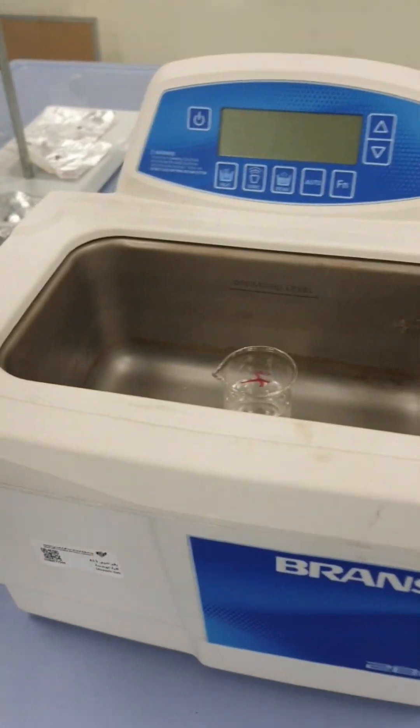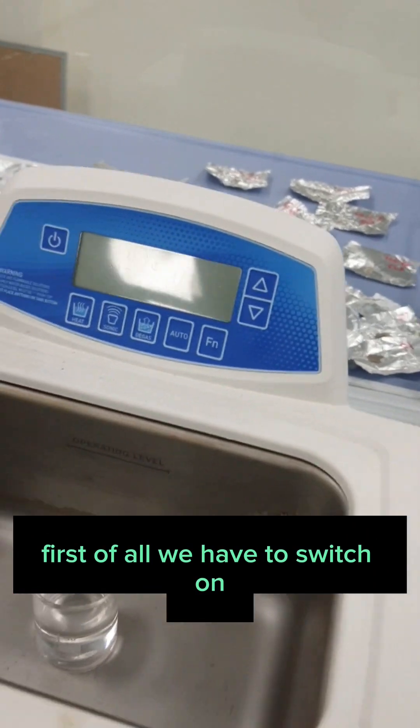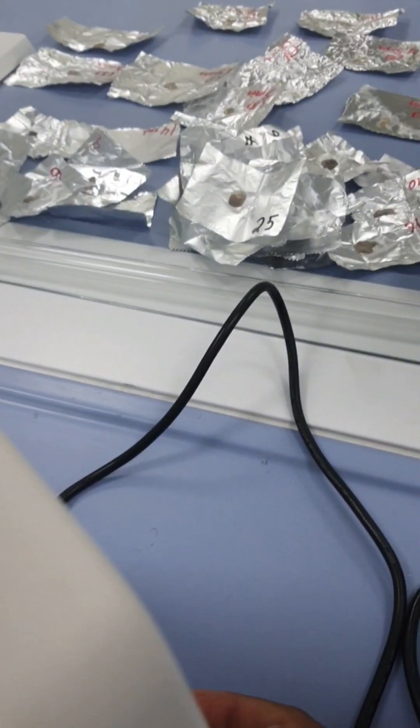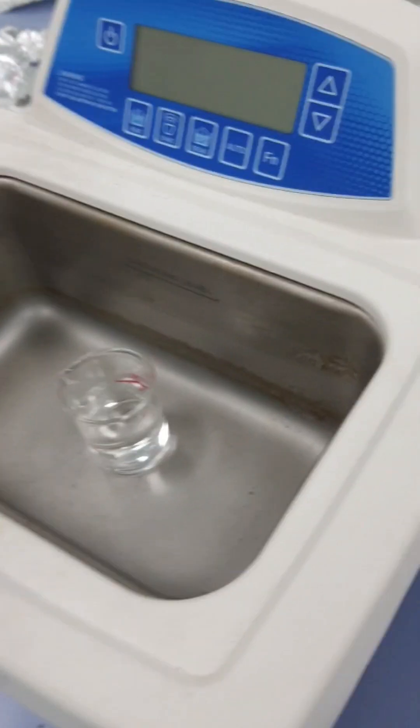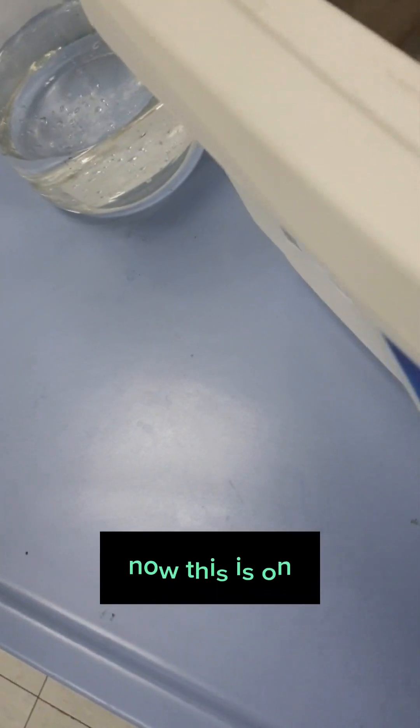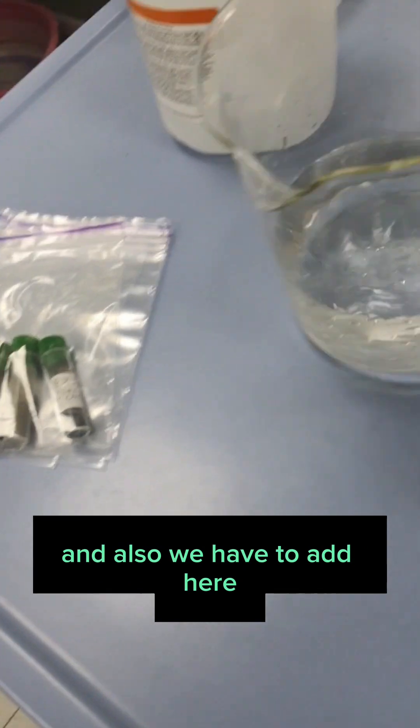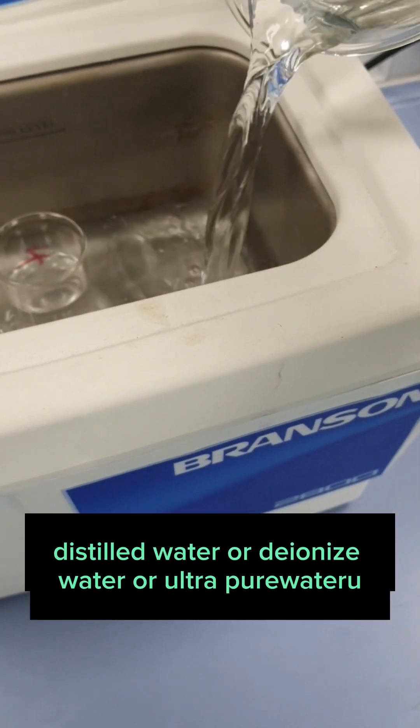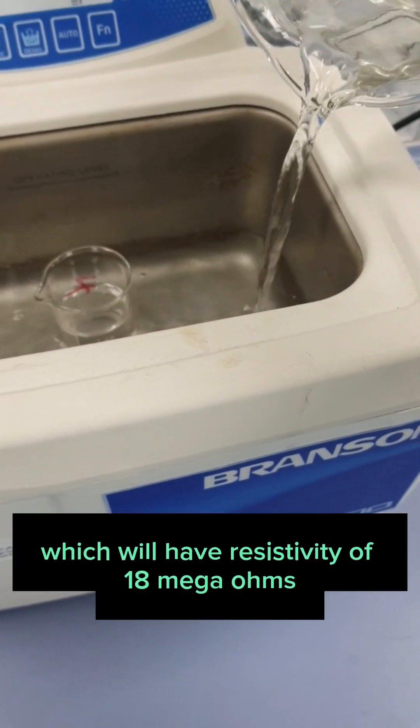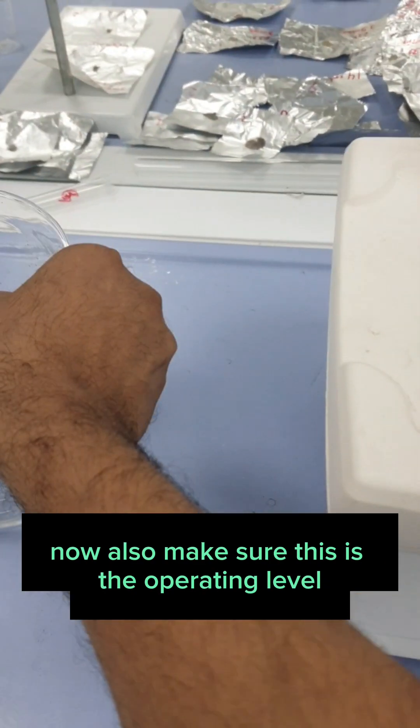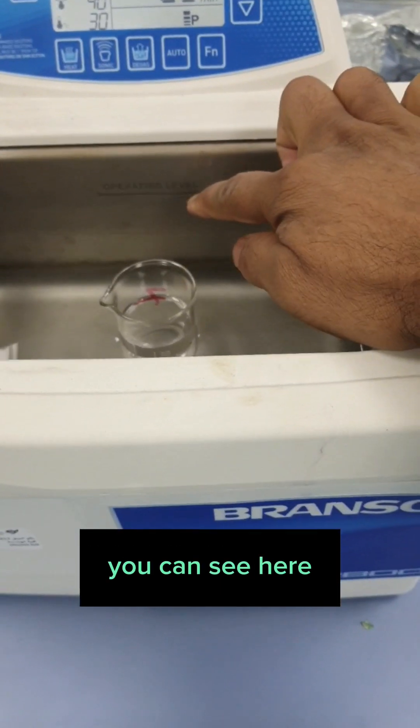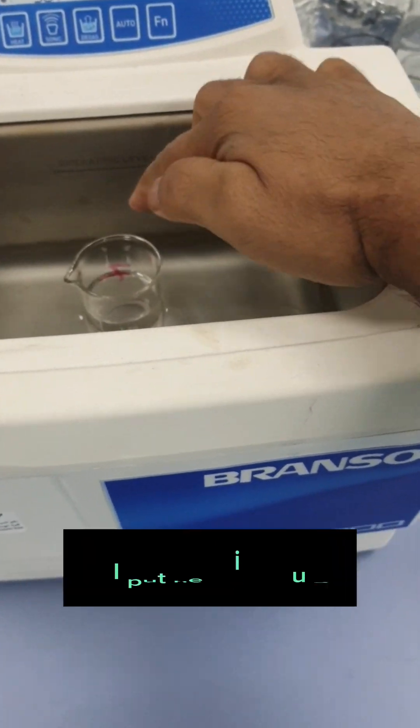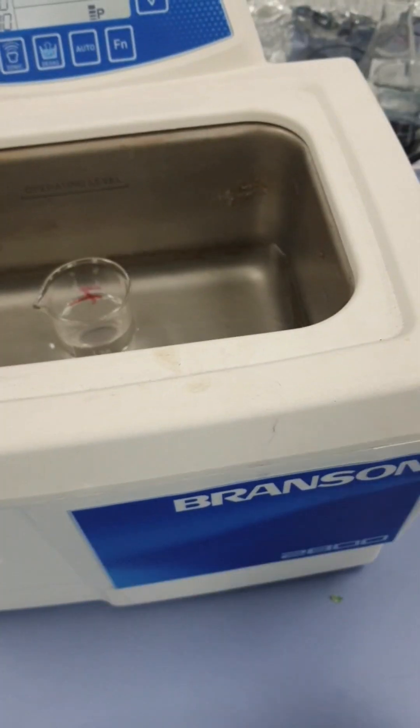This is one sonicator without probe. First of all, we have to switch on. This is already connected. You can see the power button is at the back. This is now on. And we have to add here distilled water or deionized water or high purity water which will have resistivity of 18 mega ohms. Make sure this is the operating level. You can see here. This beaker is very small, so I'm putting the water right till here. If I put here, it would be above the level.